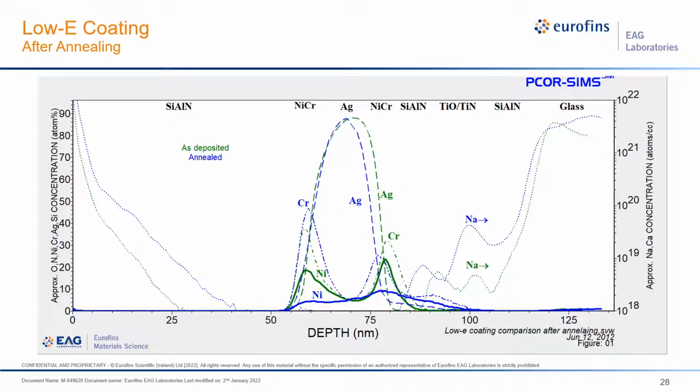But sometimes you have to be careful in interpreting these kinds of changes, and not mistake an artifact of the morphology in this material for a real effect.